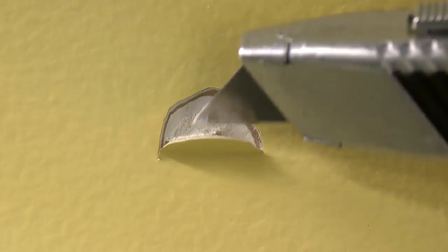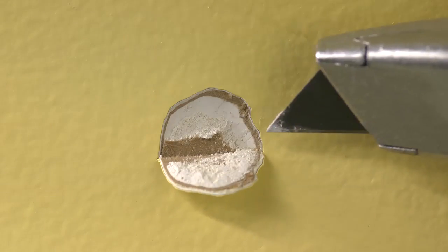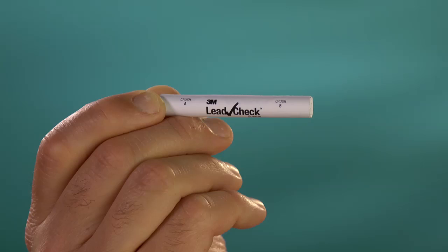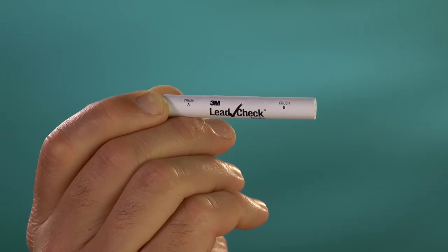Once you have cut through all of the paint layers, use the blade of the knife to fold down the semi-circular flap so that it forms a pocket. Now you may prepare to activate the 3M LeadCheck swab.